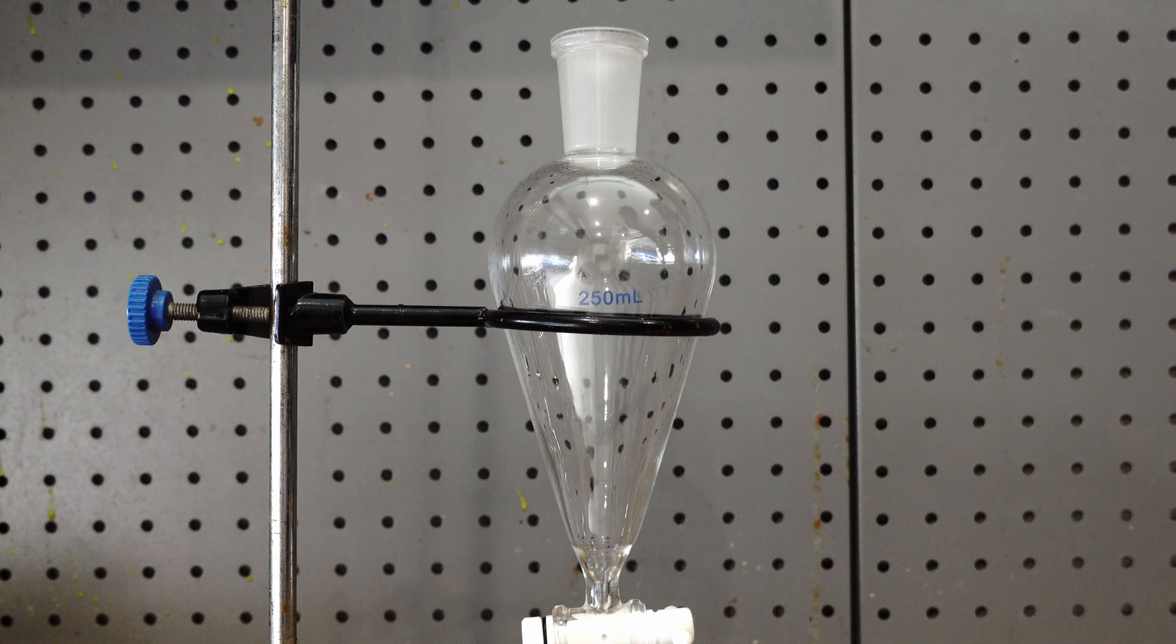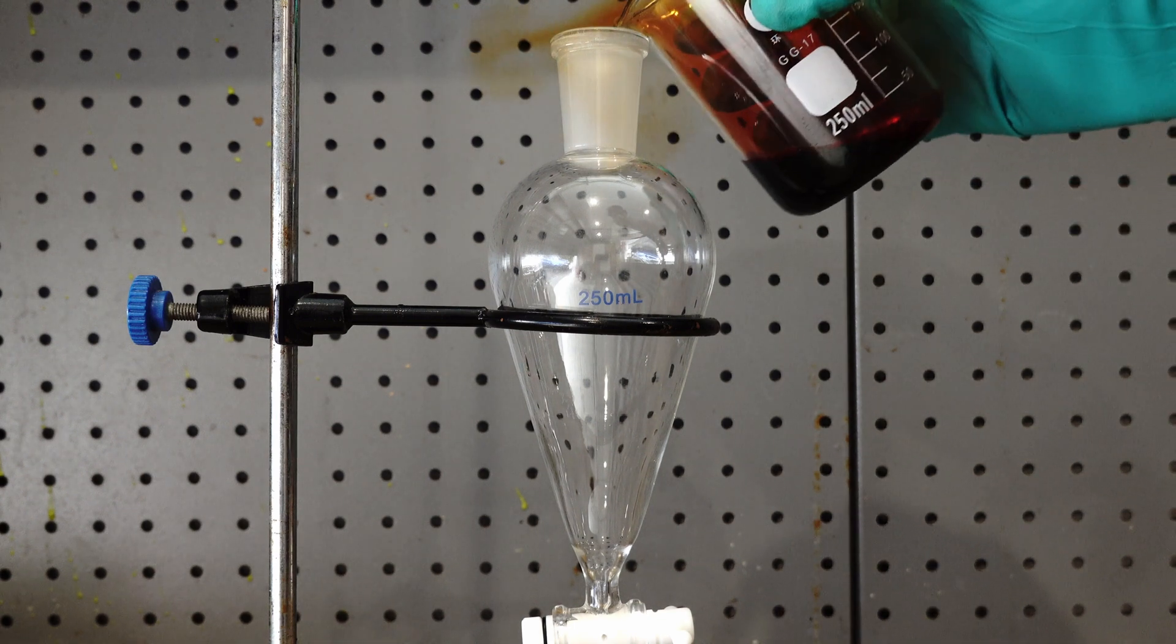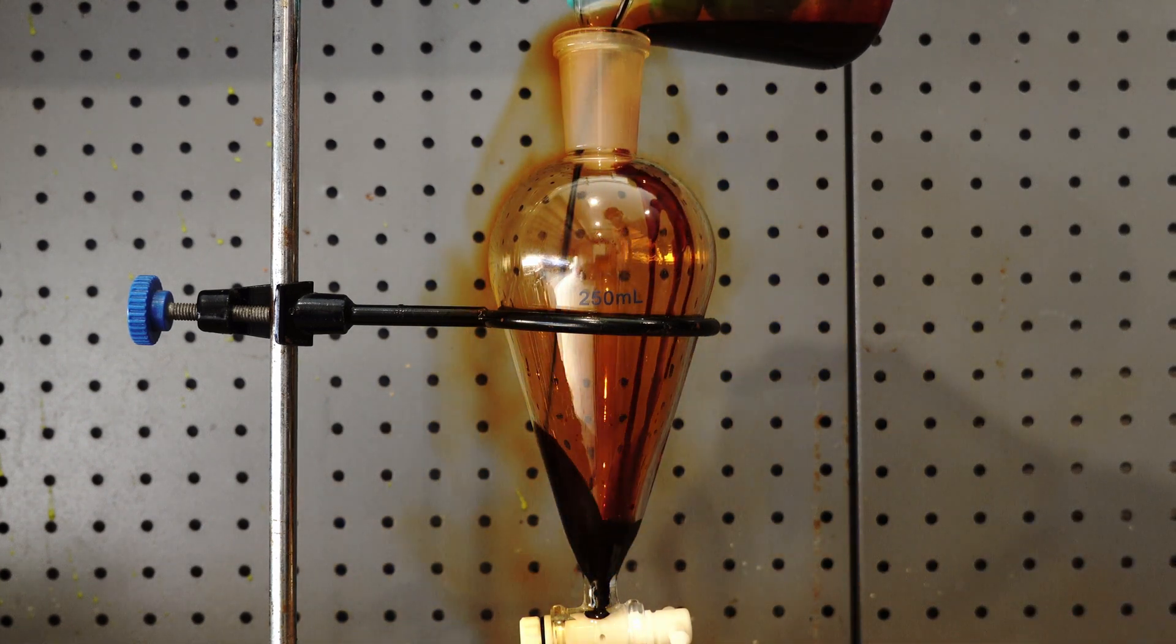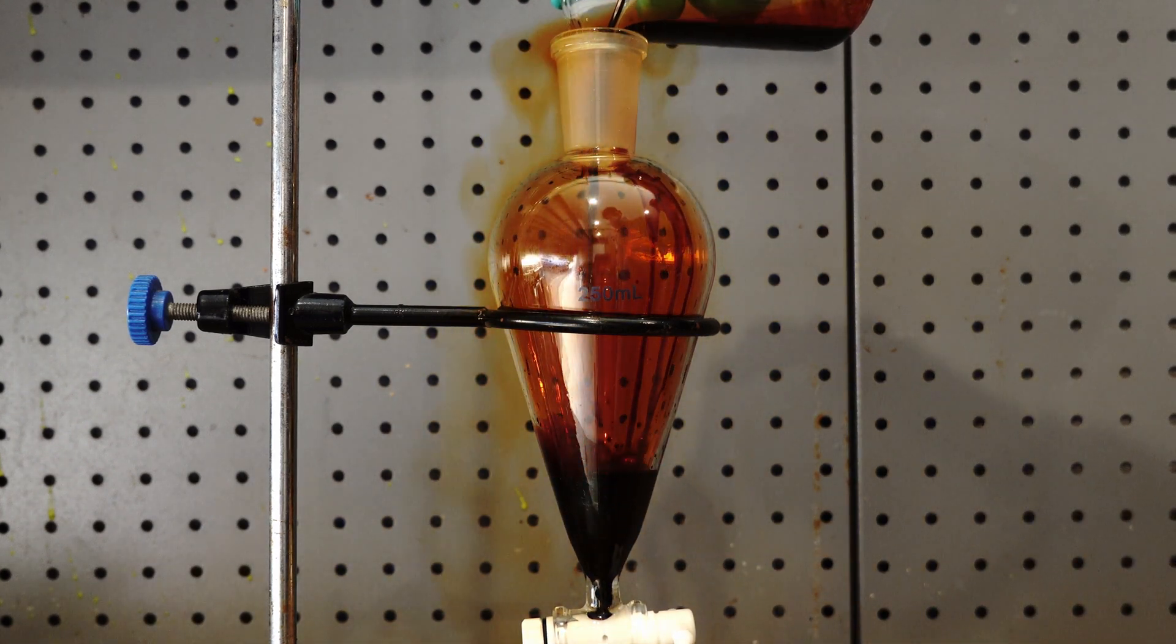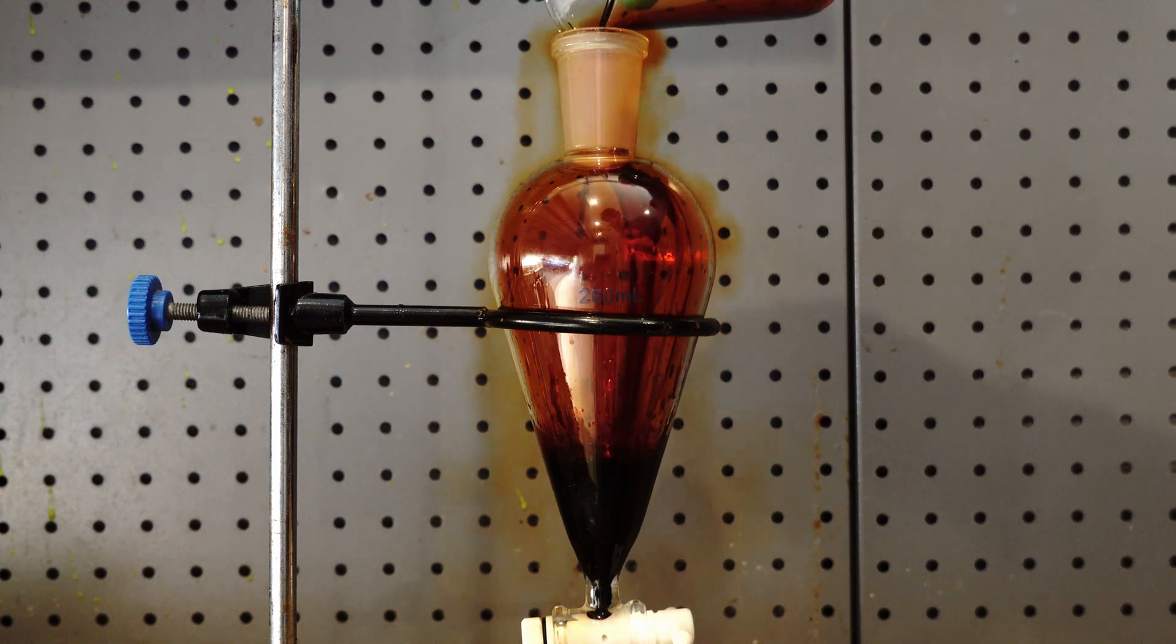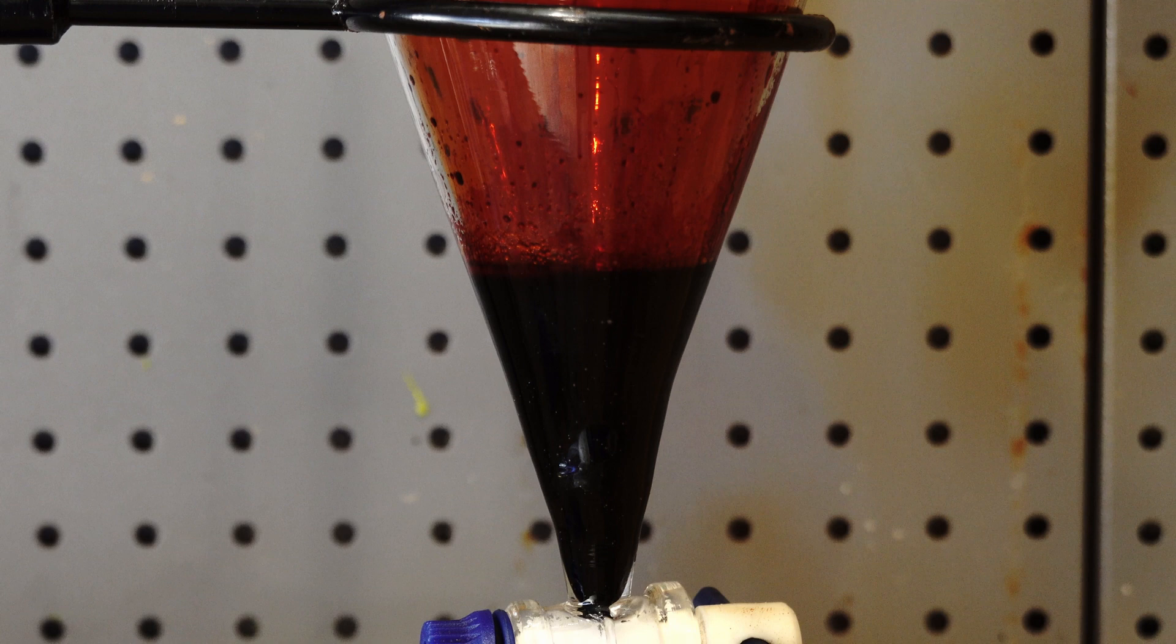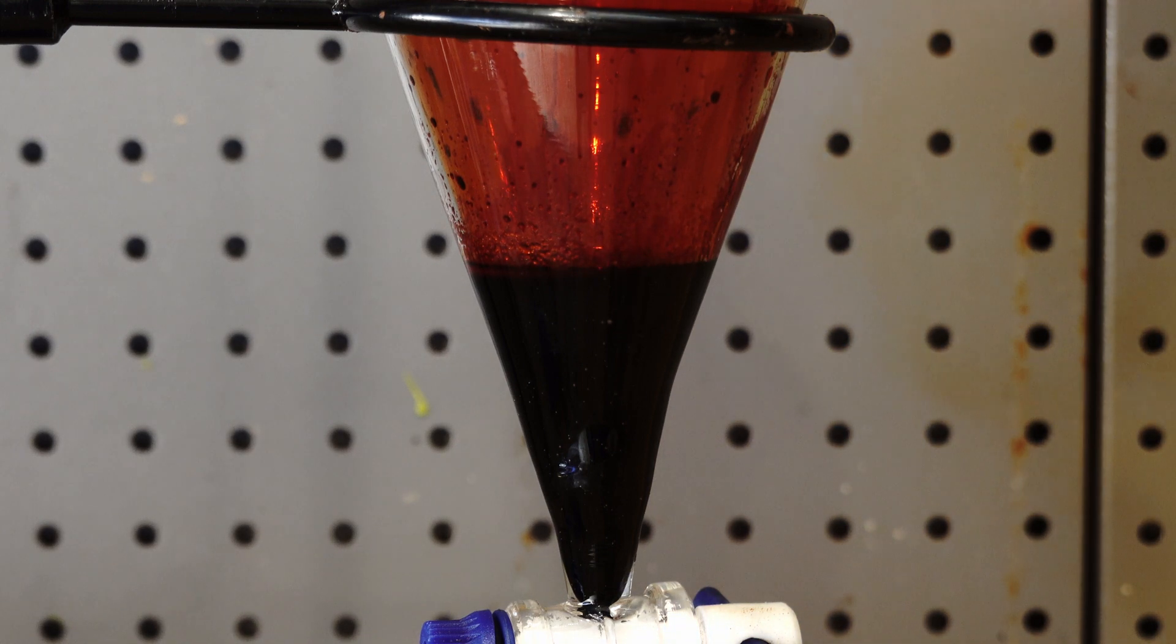Anyway, the next step is to purify our Bromine. And to do this, we add all our Bromine to a 250ml separatory funnel alongside a few milliliters of sulphuric acid. The sulphuric acid in this step acts as desiccant and pulls out all the water from the Bromine.